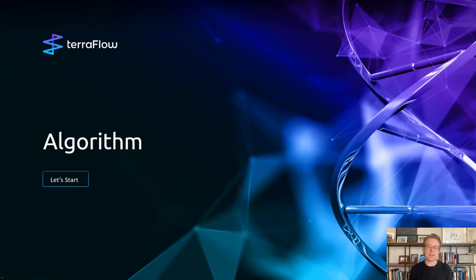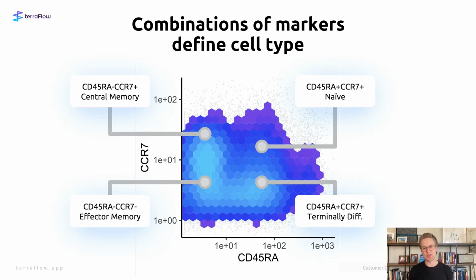What terraFlow is doing is taking emerging tools in machine learning and combining them with really decades-old fundamental concepts in flow cytometry. In flow cytometry, we often define cell types by the combination of proteins that they express on their surface.